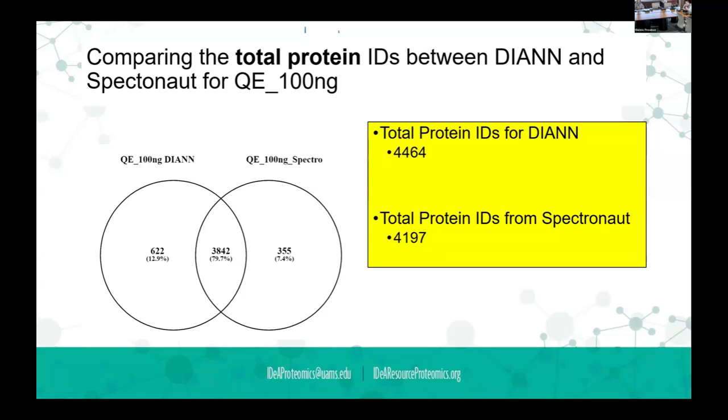What surprised me is there are no experimental parameters. There's nothing about collision energy. It just takes those sequences and generates its spectral library.